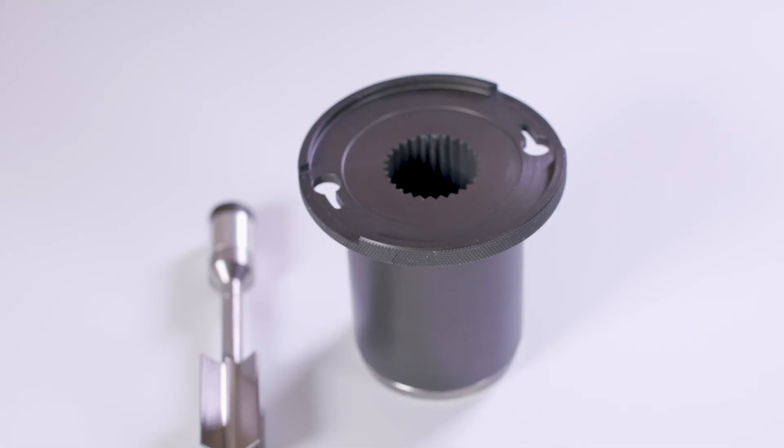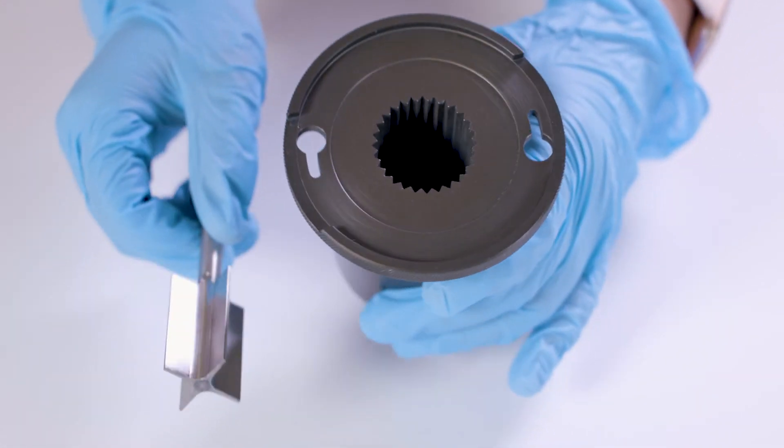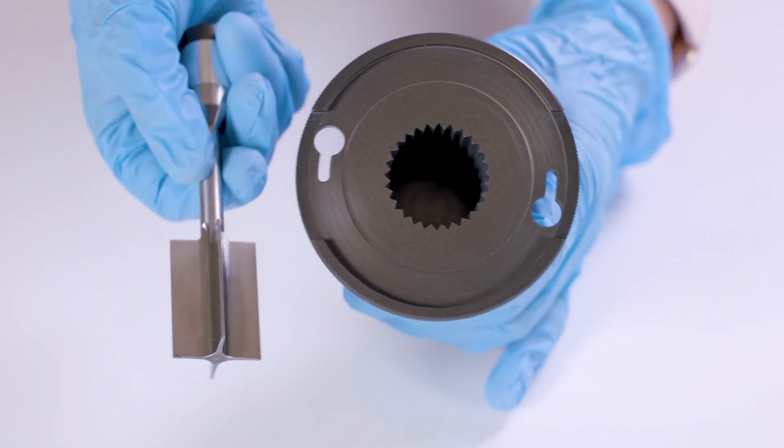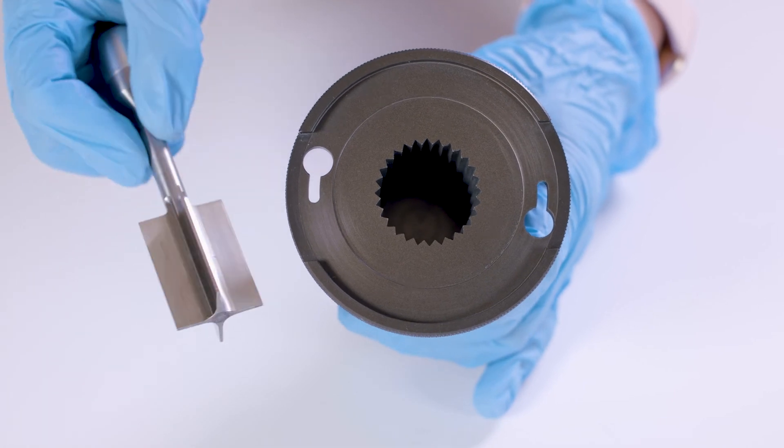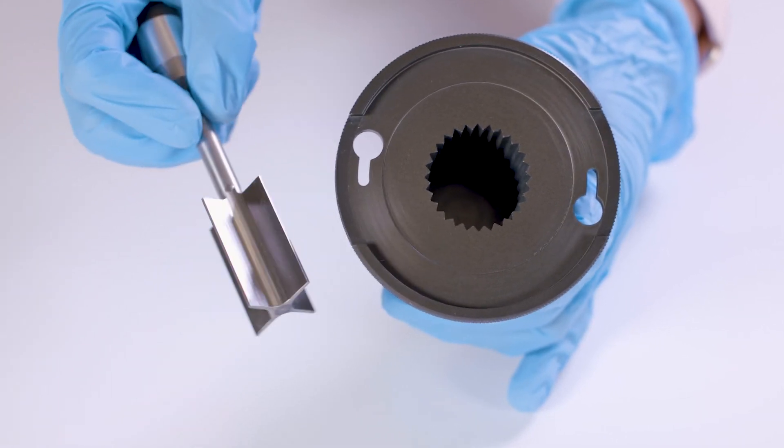In addition to rough surface parallel plates, the concentric cylinder with a grooved cup and a vein-shaped rotor also proved to be effective in avoiding wall slip during viscosity testing.